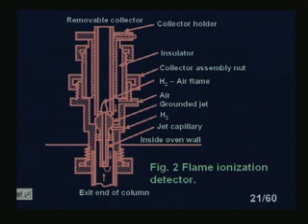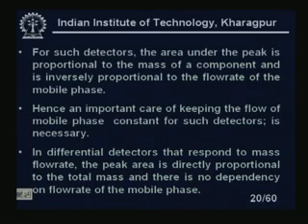You see, let us go back first of all. Now, you see, when I talked about the thermal conductivity detector, it is one of the oldest detectors and it still is used because of its simplicity. It is a very simple system and it is very widely used. Data are available over the years, people are using these things, and it is non-destructive. Okay, that is the most important thing for many gas chromatography applications, right. So, let us look at how it looks.